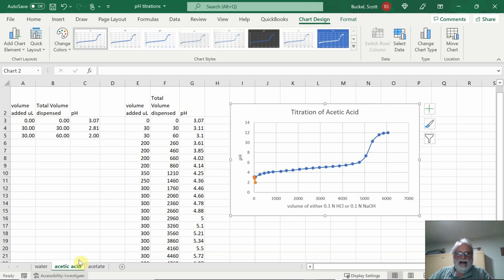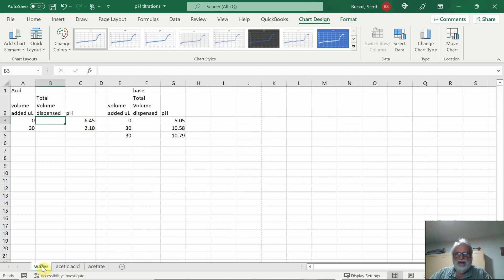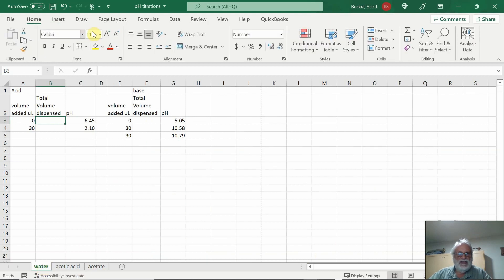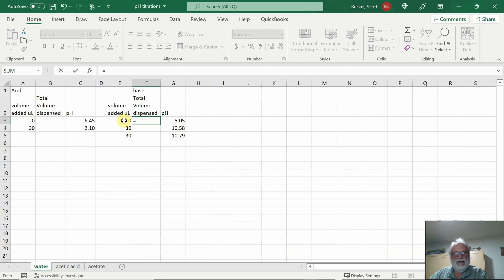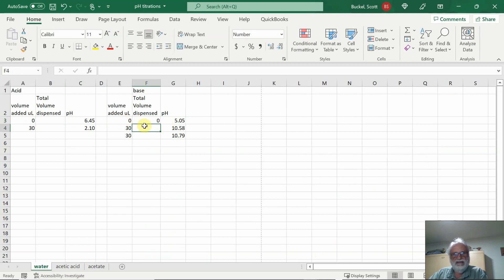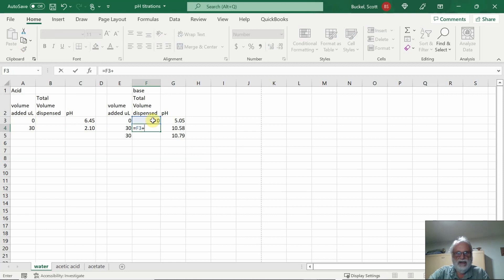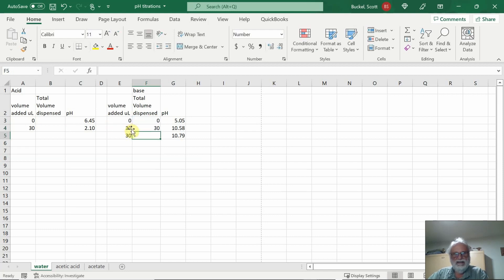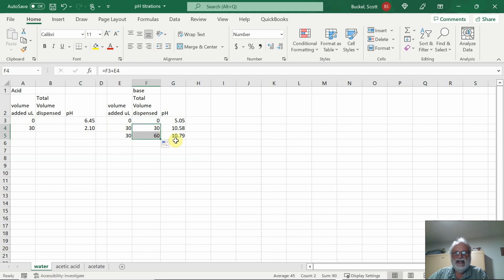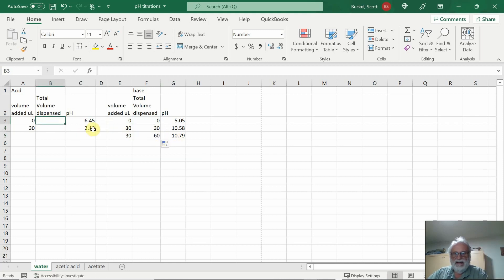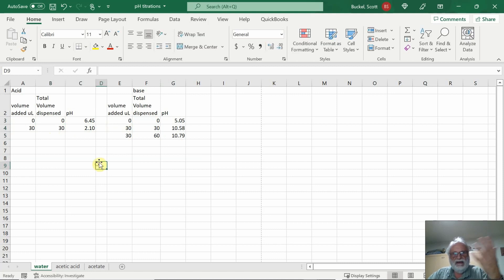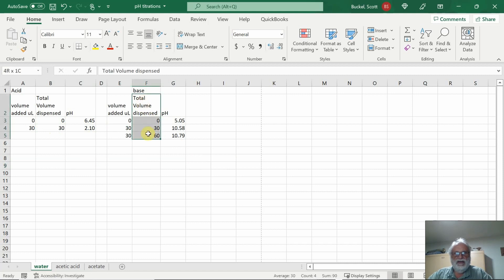It's basically keep doing the same things over and over again. Now I found that sometimes doing just a few data points, some people have a little bit more trouble with. And let's go ahead and go to the water. So I'm doing three of the different titrations for you. So here add is equal to that. Hit enter. Hit enter is equal to this plus that. Hit enter and just drag it down. Typing 30 and 60 would have worked. We can type 0 here and 30 here and it works the same way.